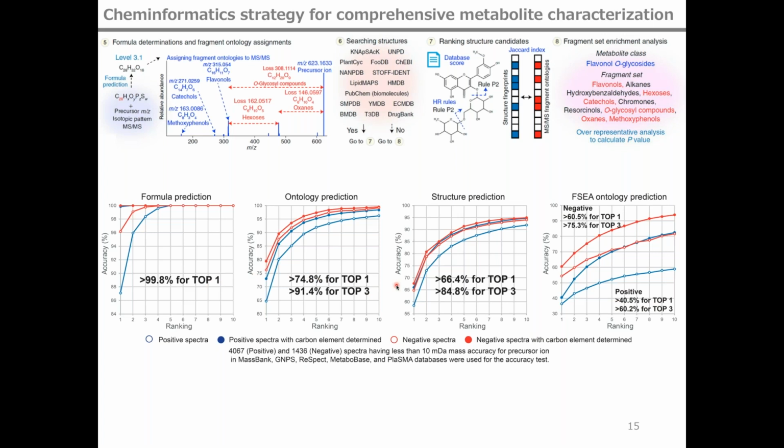These accuracies may depend on the size of the database, but we concluded that the accuracy of our platform is very good for considering candidates for unknown spectra.